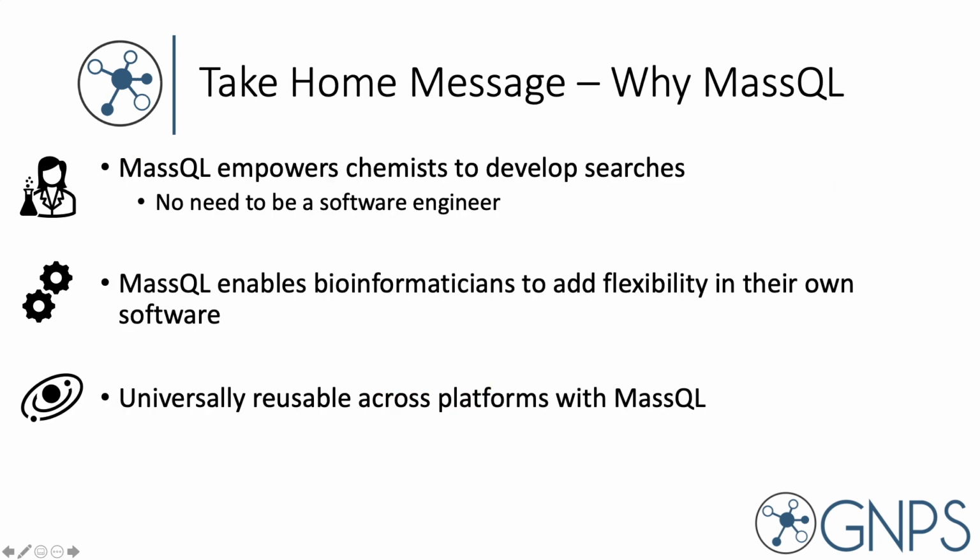And so the final takeaway I want to have from this presentation is that MassQL, we hope that it empowers chemists and mass spectrometrists that might not be experts in software development and scalable systems to be able to ask these kinds of questions at scale in a super flexible way.